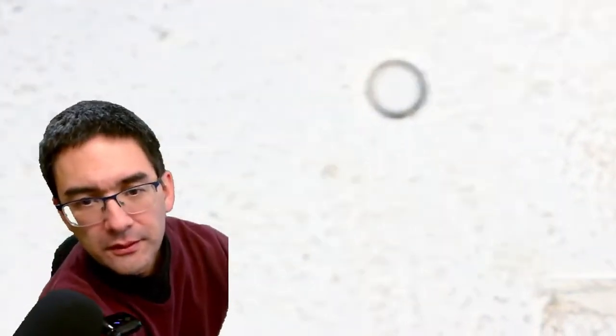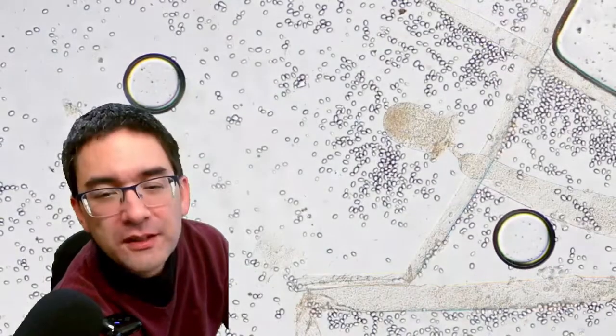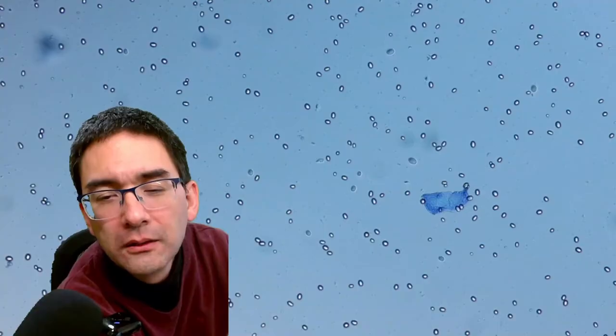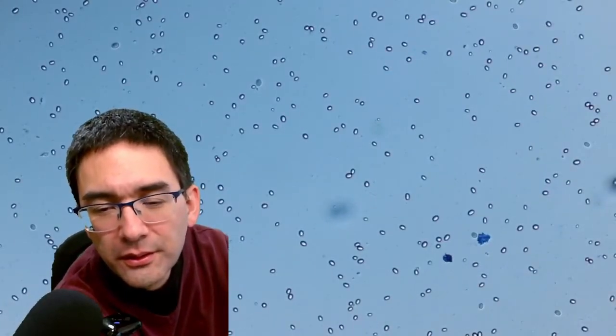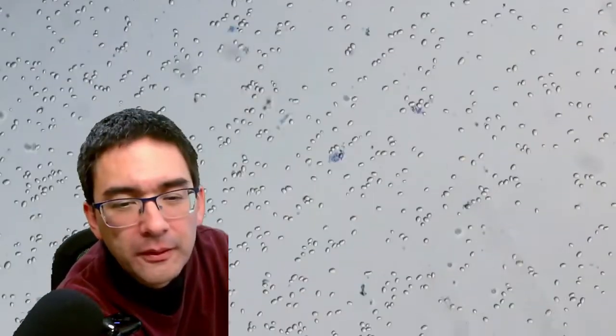So I need to go back to the microscope view. So let's have a look. So we've already seen this before. So now where is the stain? Can't find it. Here it is. Not very dark. Look at this. It does stain something else. Some other cellular debris, but it really doesn't seem to stain the spores a lot. I've seen this already before. And there is not a lot of stain here. Here it becomes more and more blue. Look here. That's quite a lot, but it doesn't seem to stain the spores very well.